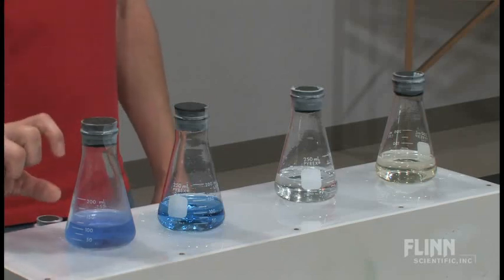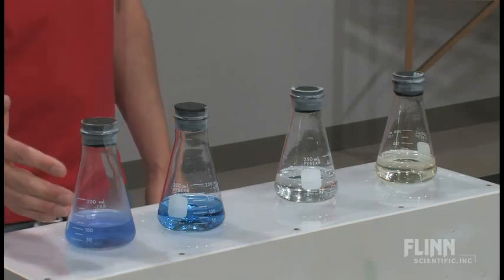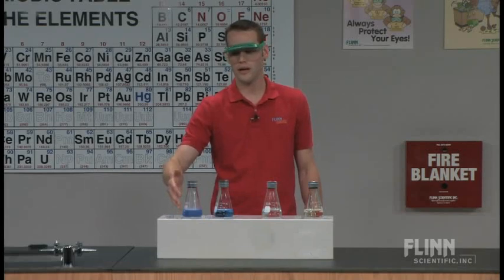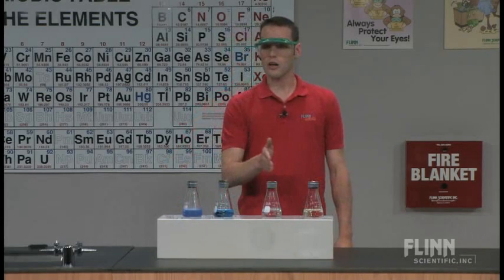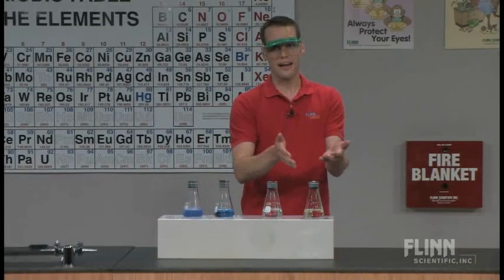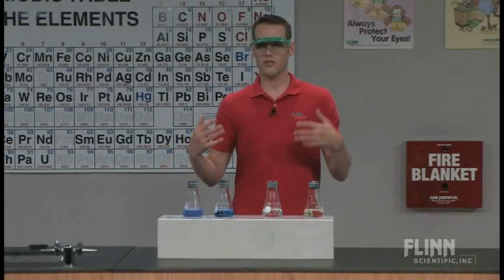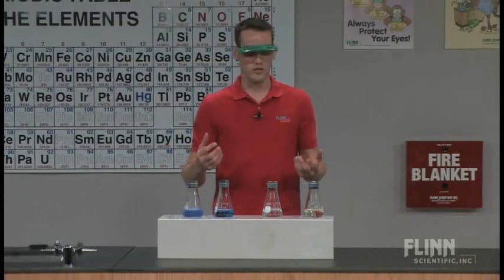There's so much that's gone in here, and the molecules are moving so closely to, we're so close to a freezing point, the molecules are moving very slowly, that this one sometimes never even changes for me. So the students can get a very clear visual picture that higher temperature will allow for a higher reaction rate. So it's a really nice visual demonstration for something that kids can't usually get a good picture for.